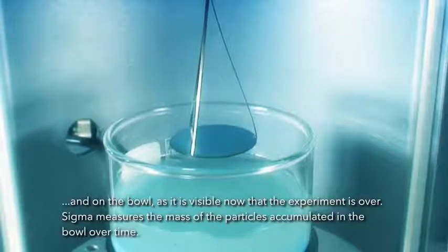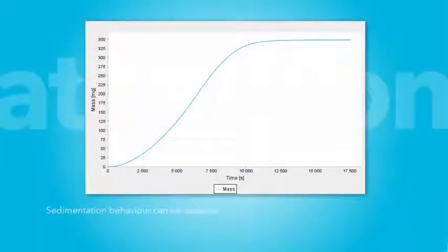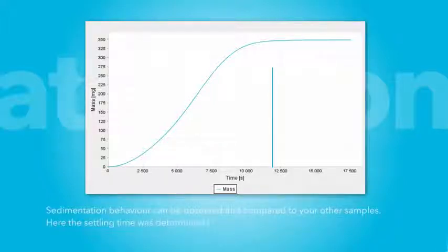Sigma measures the mass of the particles accumulated in the bowl over time. Sedimentation behavior can be observed and compared to your other samples. Here the settling time was determined to be 3 hours and 20 minutes.